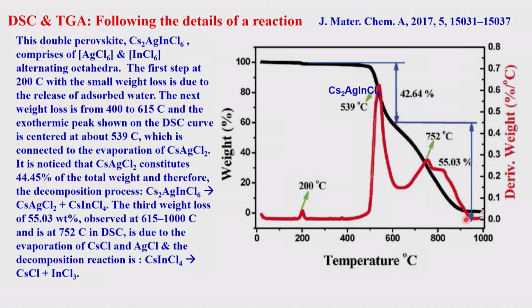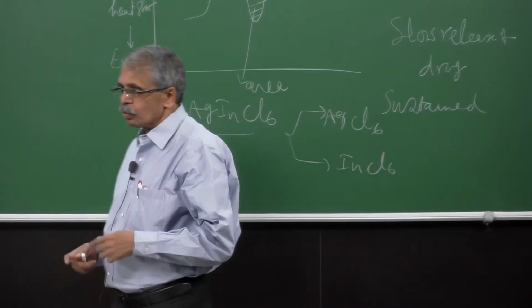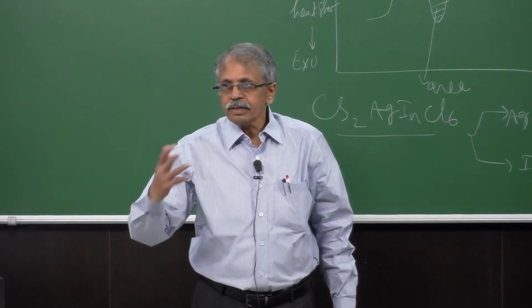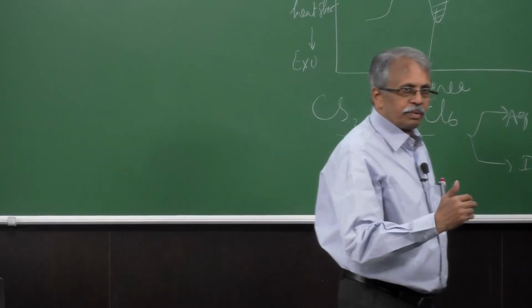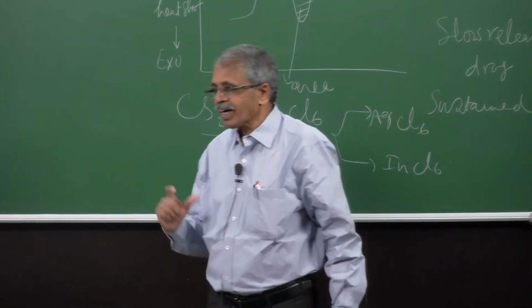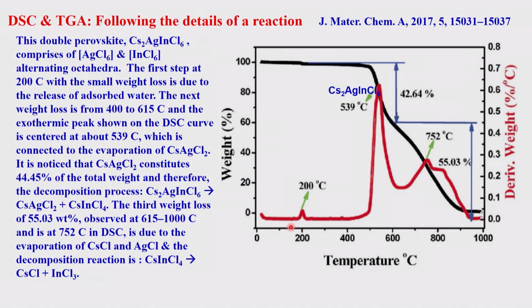What does that mean? You have been making some volatile kind of compounds. So, what are those volatile compounds? Everything is revealed by this particular thermogram and further assisted by the DSC thermogram. The DSC thermogram will tell you whether it is endothermic or exothermic, and your TGA thermogram will tell you how much, to what extent, and what it will fit to. Now, if you look at this very tiny one, it will not fit to any of these components at all. It is a small amount of water adsorbed on this solid material that you have taken, and that is what is going out.